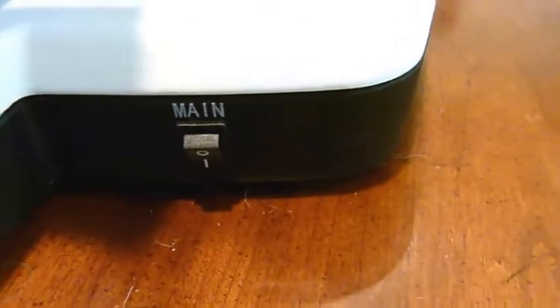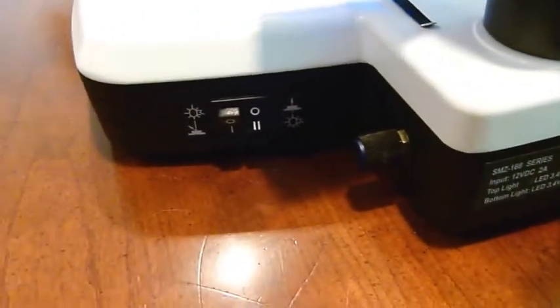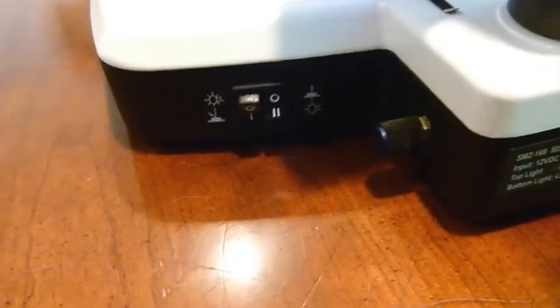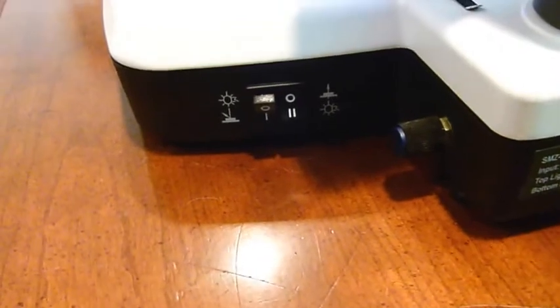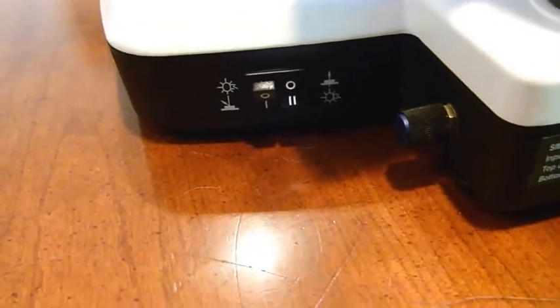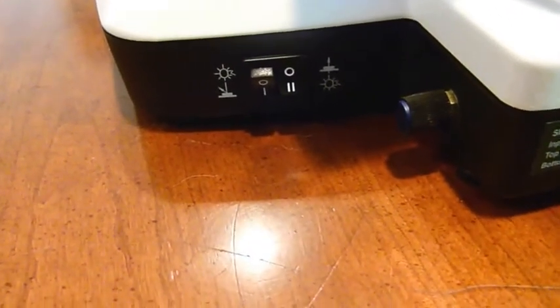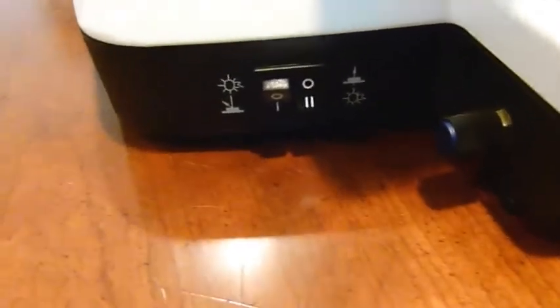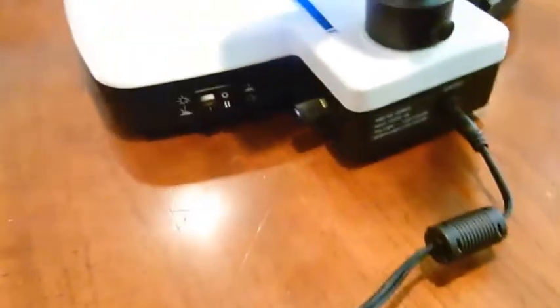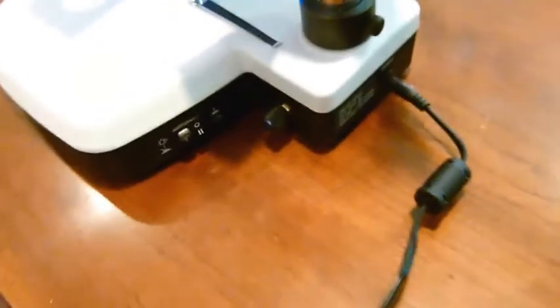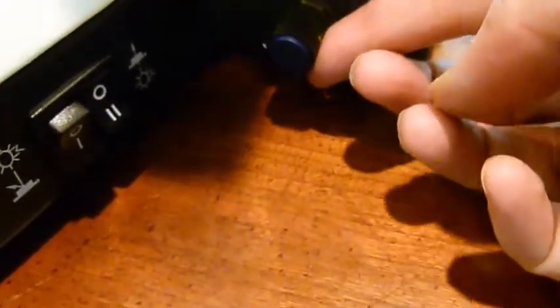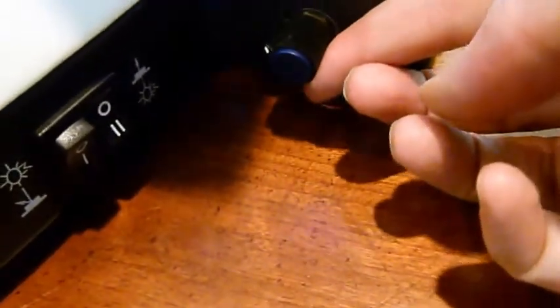And here are the controls. There's a main power switch here. Here are on-off switches for the lower illumination and for the fluorescence illumination. This is the brightness control for the bottom trans illumination, and here's the control for fluorescence intensity.